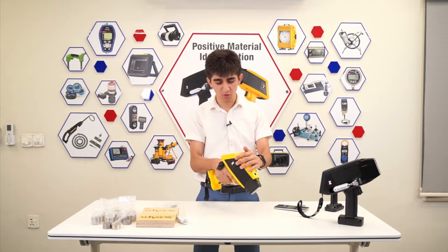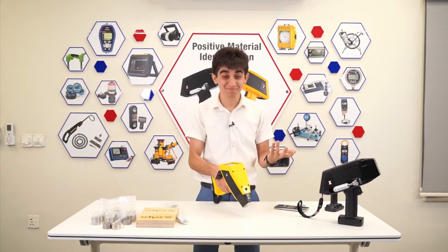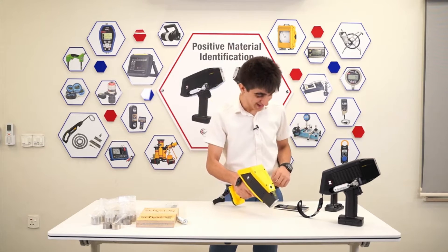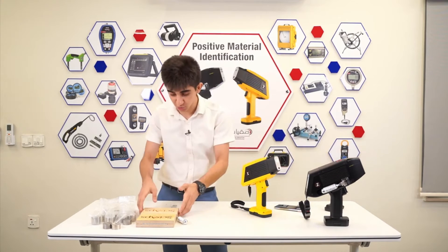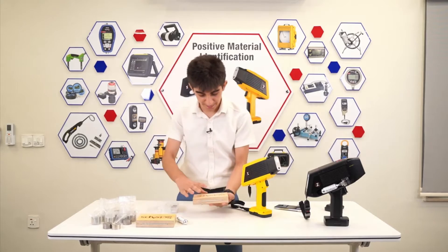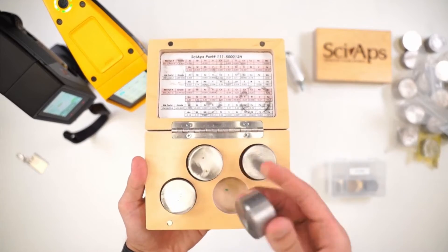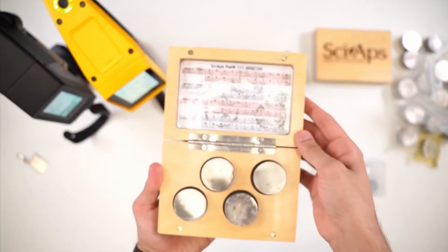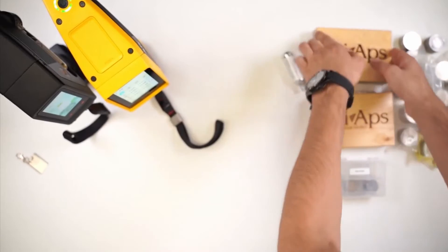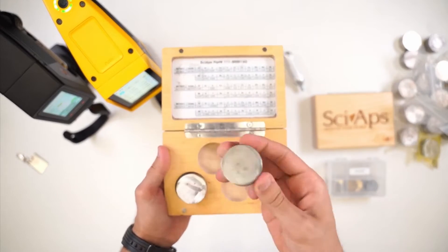You see that a camera pops up, because why not take a picture? Now, this LIBS unit — the Z902 — comes with some test blocks. As you can see, some certified reference material blocks here. We're going to use these blocks to run some tests on both of the units.